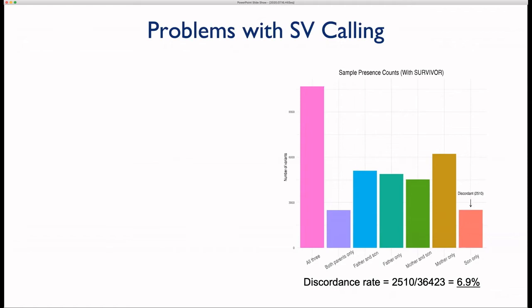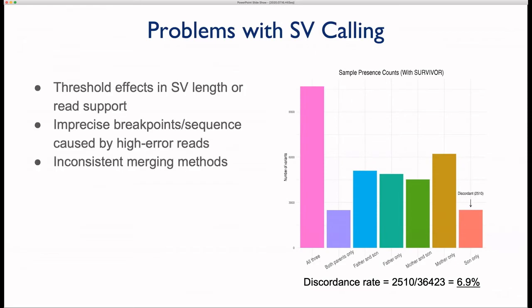So we've been trying to systematically dissect what are the sources of error, how can we combat them, how can we improve this to get it down from, say, thousands to maybe a few hundred, of which many of these could actually be real. So we've identified three major issues that lead to false positive calls in these studies. Let me give you a quick tour through what we've noted about them.